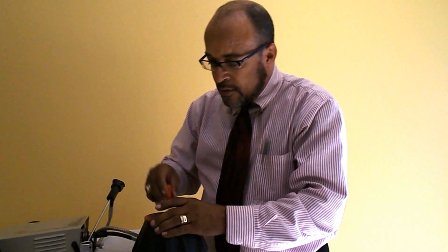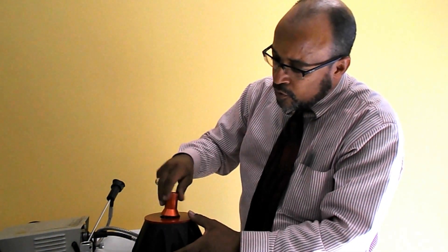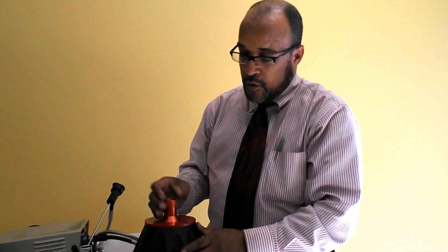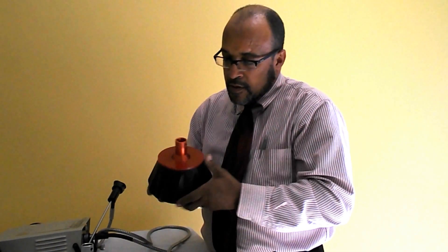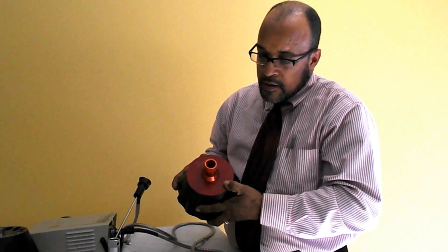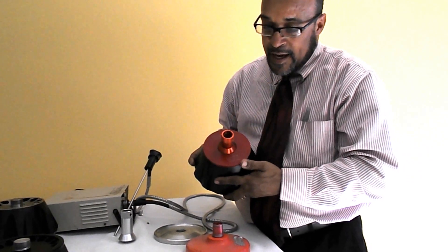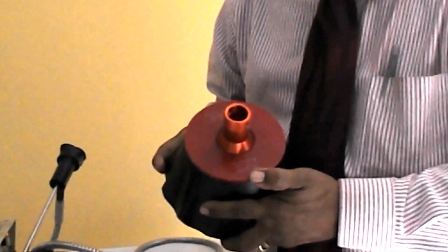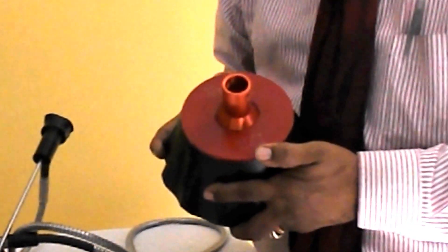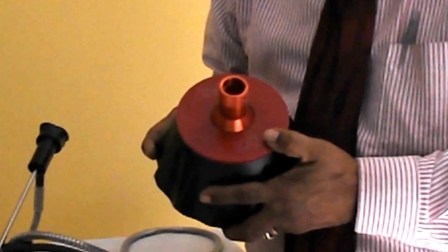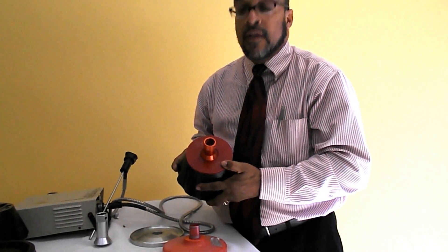We have our titanium rotor which is the type 70.1 rotor which goes up to 70k. In the name of the rotor, you will have the speed designation. Like this, it is a type 70.1 Ti, which means that it goes up to 70k. And it is a Ti for titanium.